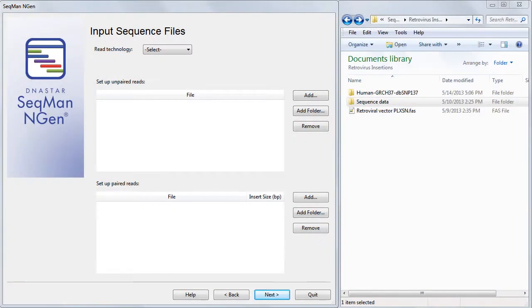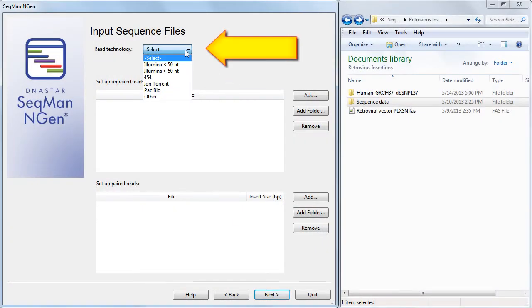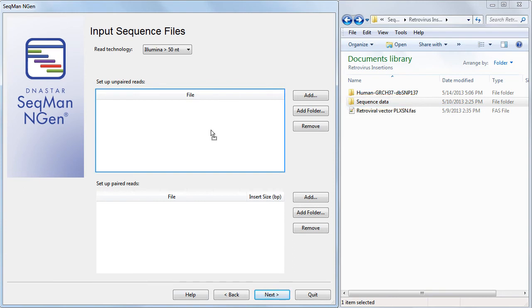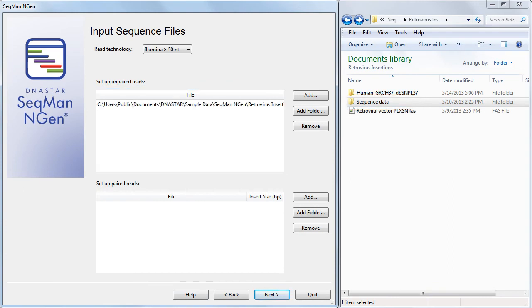In the Input Sequence Files wizard screen, I need to choose the read technology, which is Illumina greater than 50 nucleotides. Then I can just drop our folder of four sequences into the unpaired reads area and click Next.